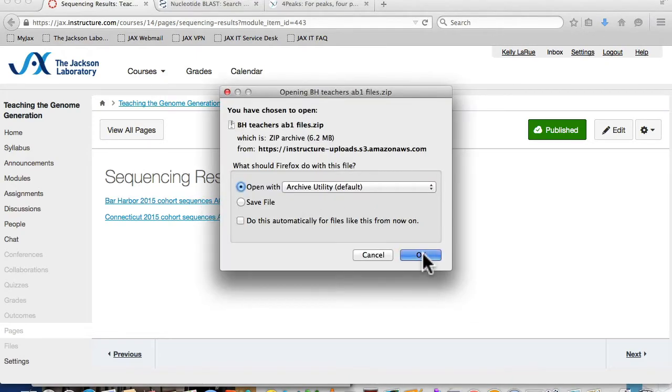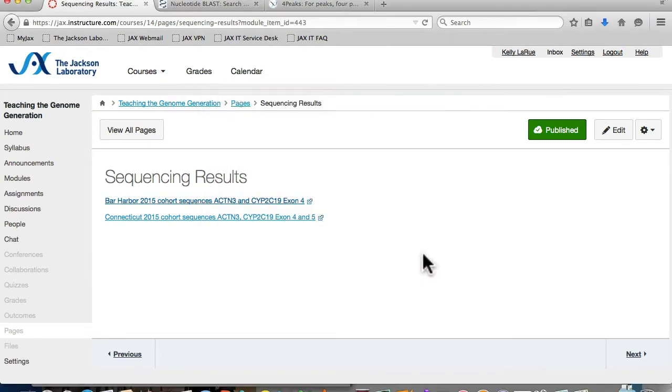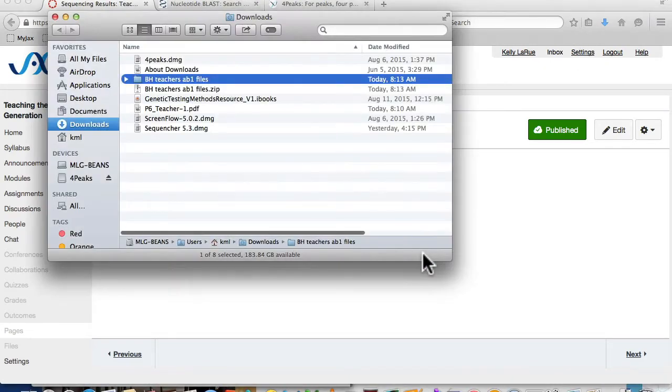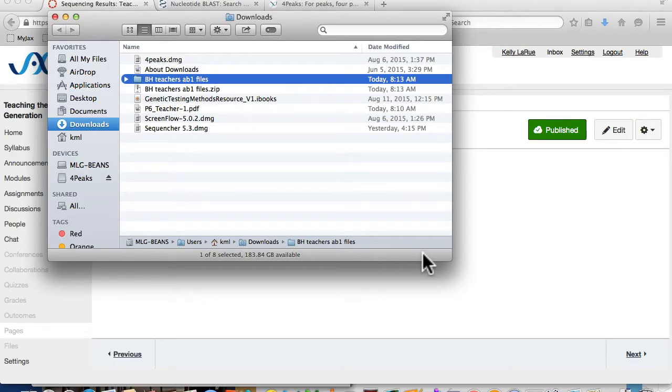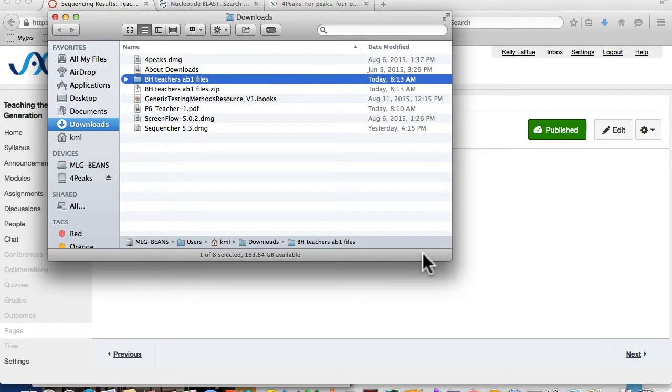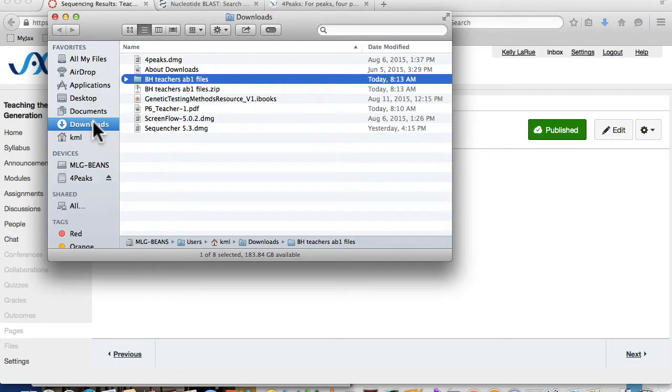Download your class data by clicking on the link. The data is downloaded as a compressed .zip file. The Mac automatically uncompresses the file, but PC users will need to right-click and uncompress the file in order to access the data. Keep in mind that the data is normally held in a Downloads folder, unless you specifically save it elsewhere.